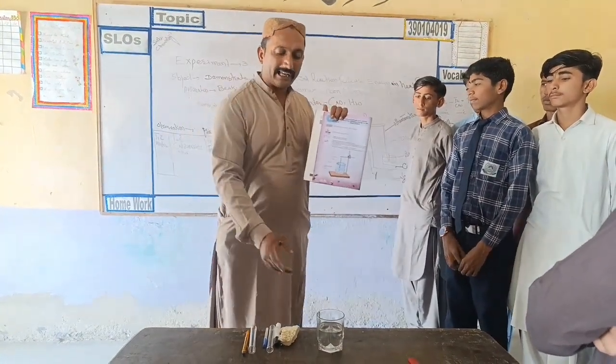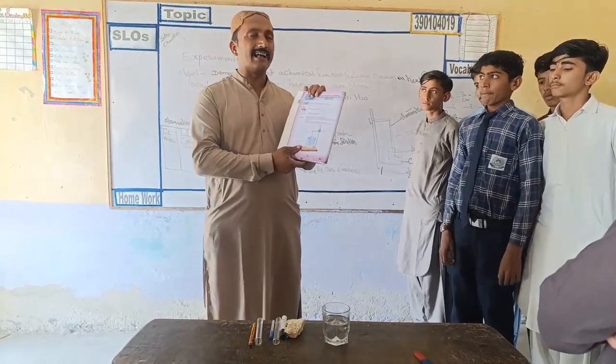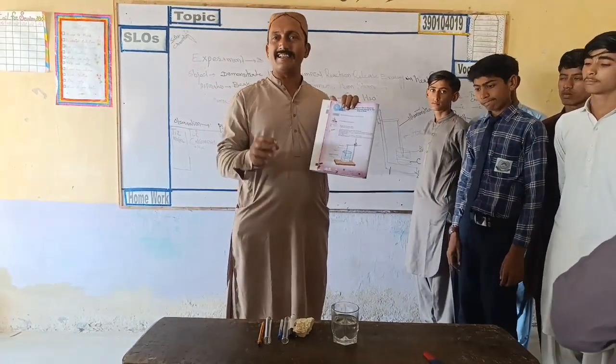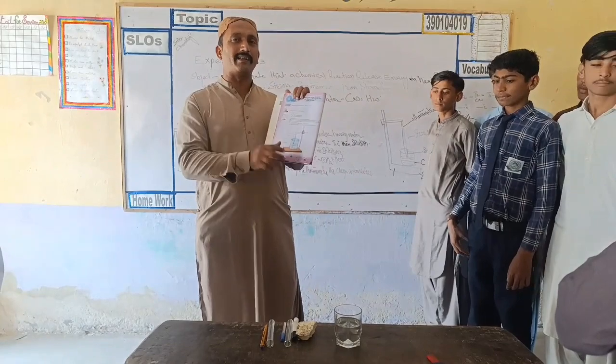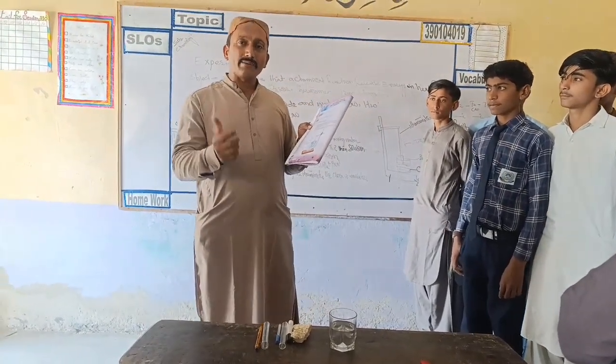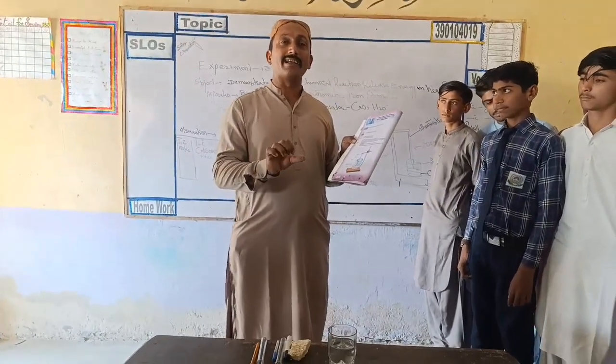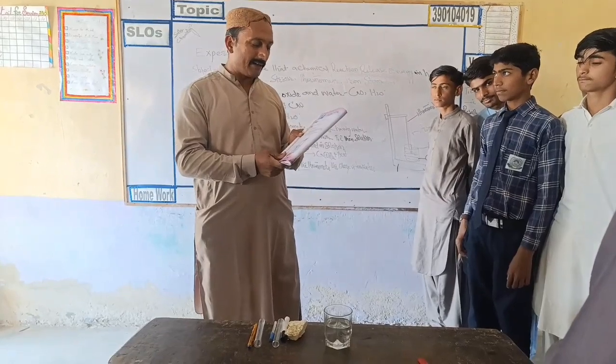First of all, take a beaker. Second, take a thermometer. Third, a stirrer or iron stirrer. These are the apparatus required for the experiment. Our chemical reaction requires calcium oxide plus water; both are the chemicals used in the chemical reaction in our experiment.